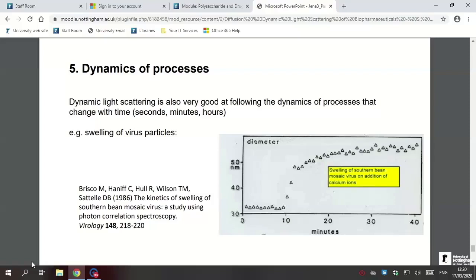So that's an introduction to DLS. You should be familiar with how it operates. Don't worry about all the physics behind that. That's all dealt with in the instrumentation, but by showing you this, you've got an appreciation of how the DLS operates and the limitations. It's a great technique. It's relatively low cost compared to other instrumentation. It's very rapid, but it's not as accurate as, for example, the ultracentrifuge for looking at sizes, but it is rapid, and it will allow you to follow changes in systems quite rapidly.